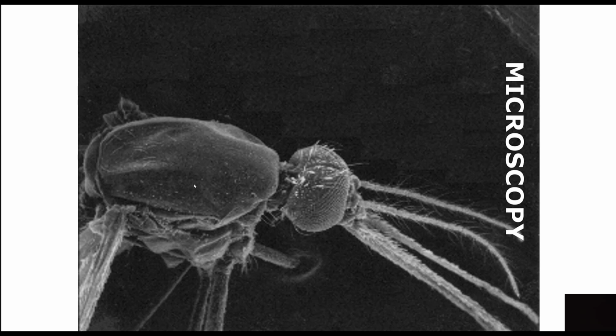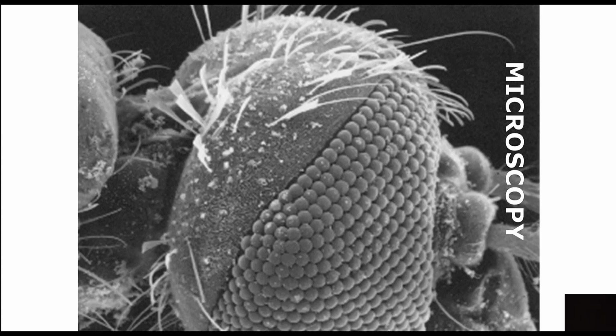So here we have a mosquito, and if you put an imaginary switch in your mind here, just to toggle a rotation type switch, it's got 3 settings. Let me click it to the next setting. That's all I'm going to do with a scanning electron microscope, is just click it to the next setting, and you can see that I can zoom in.